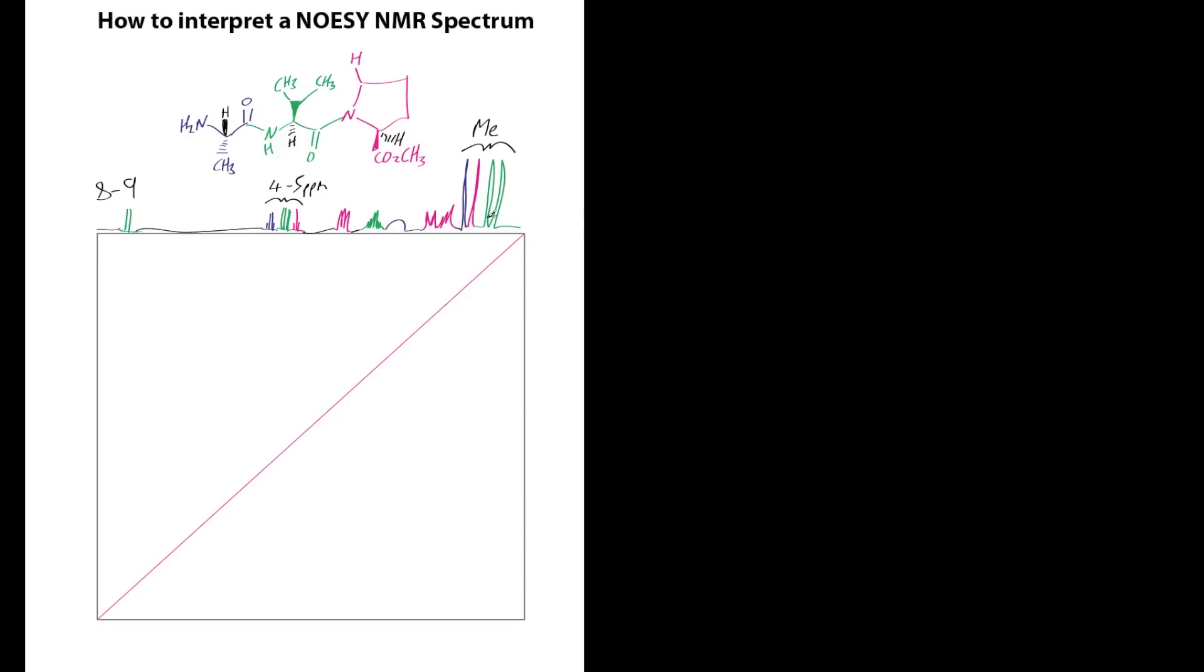They're not really easy to interpret because we've got CH3 there, CH3 there, CH3 there, and CH3 there. So they're not a good starting point. That would be a good starting point, there's only one of them, and that's that.